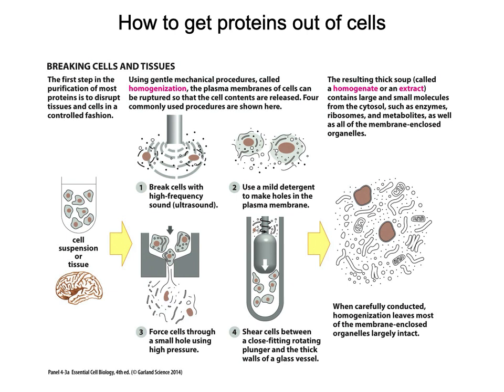And so in order to create a homogenate or an extract, there are 4 different common methods. And you can see that in the middle of that figure. We have these 4 different methods. Okay, so one method that's used is taking the cells and treating them with high frequency sound, or an ultrasound, so that can help to break apart the cells, and so the cell membranes are destroyed, so all that material that's inside the cell is released.